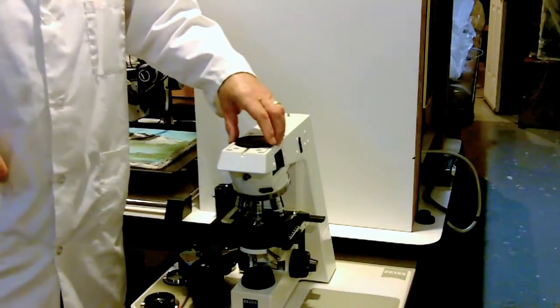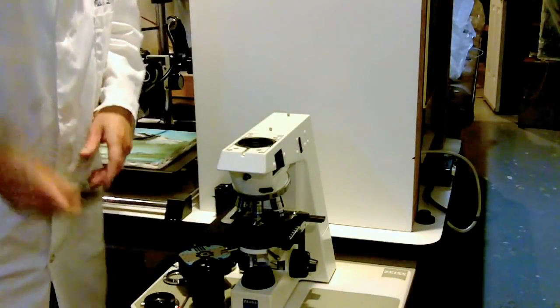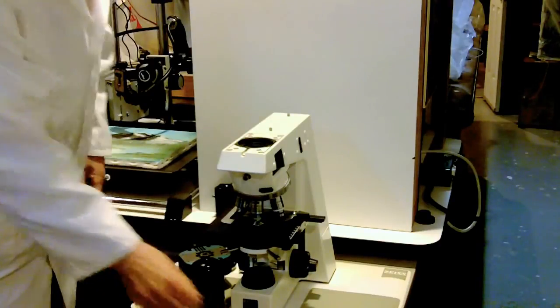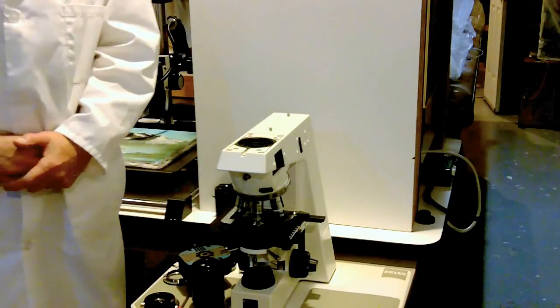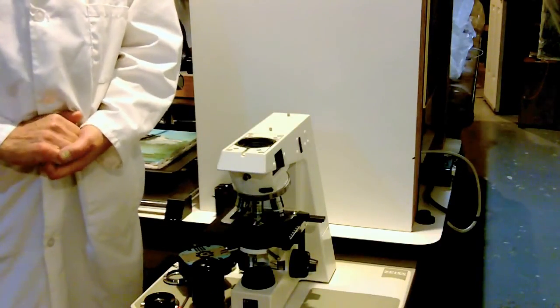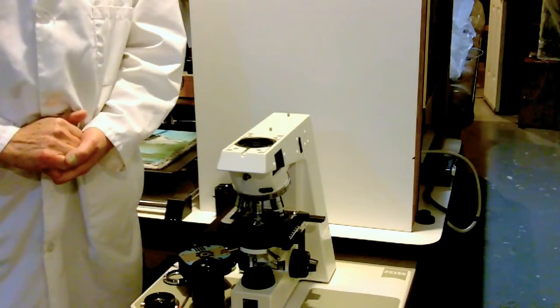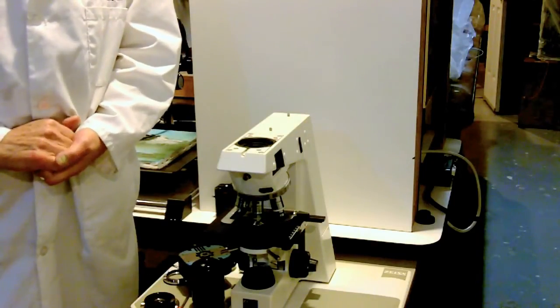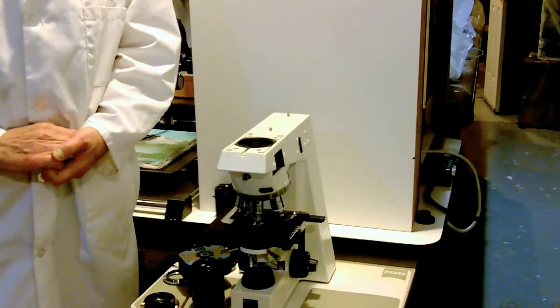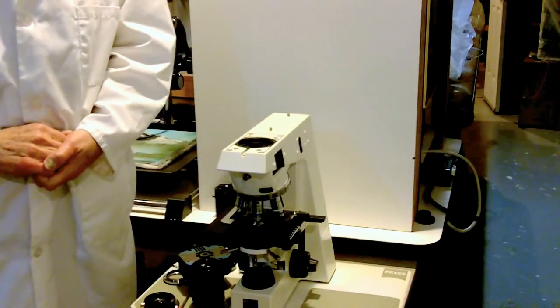Today I'm going to talk about a way to update older microscopes or even new modern infinity corrected microscopes. Old microscopes typically were set up for finite tube length of 160 or 170 millimeters.